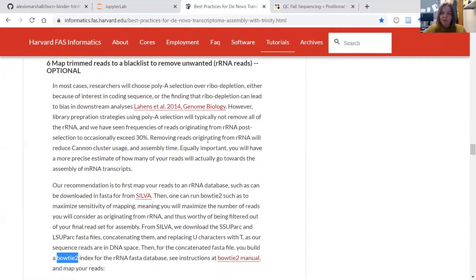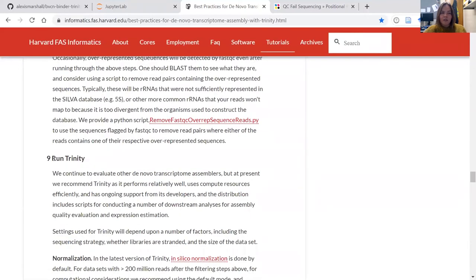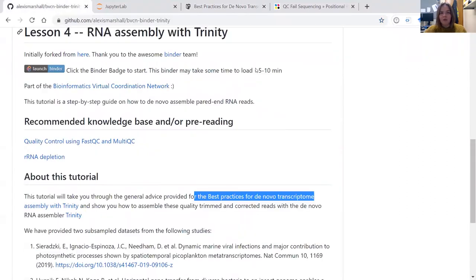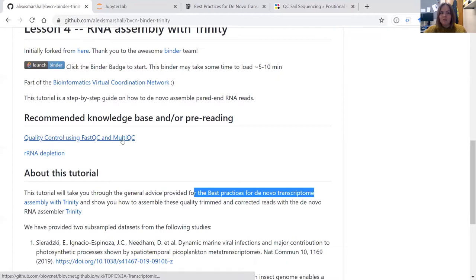We're then going to run Trinity very quickly with its base requirements, and I'll show you how to run initial statistics on the assembly to see what the average read length generated was. If we go back to the BVCN page, you'll see links to previous lessons on how to run FastQC, MultiQC, and also the SortMeRNA tutorial. I highly recommend watching these if you are new to this type of analysis.